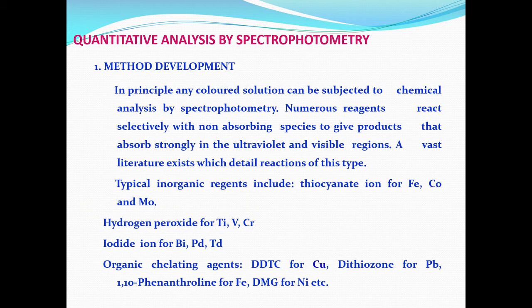What I want to tell you is, there is a specific reagent which you can use to determine the analyte using a specific reaction, and such reports are available for almost all the elements of the periodic table except maybe some radioactive elements.